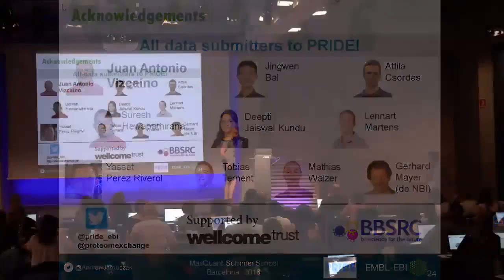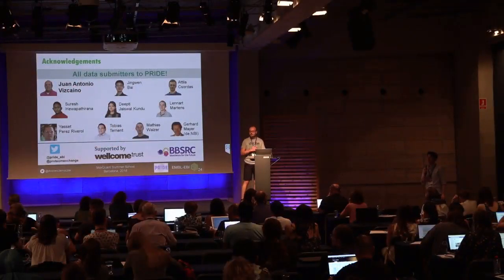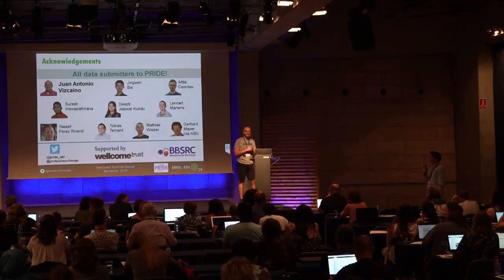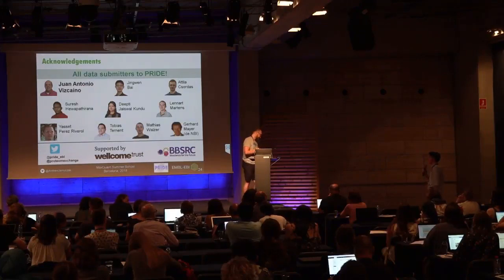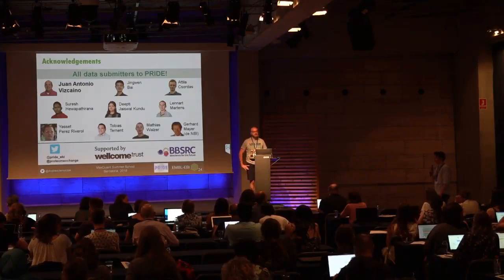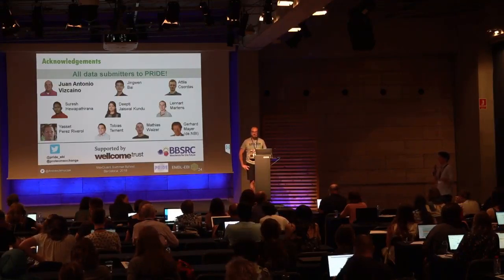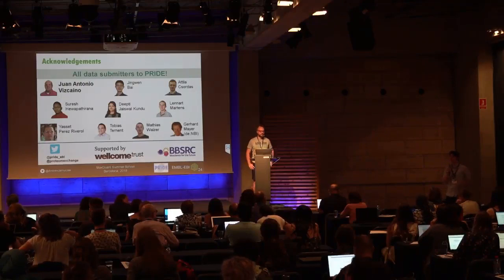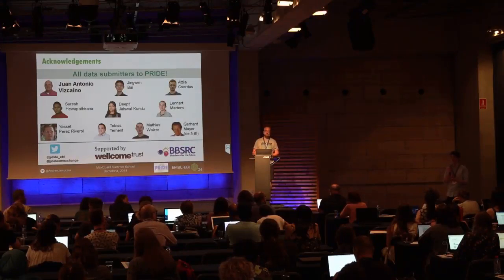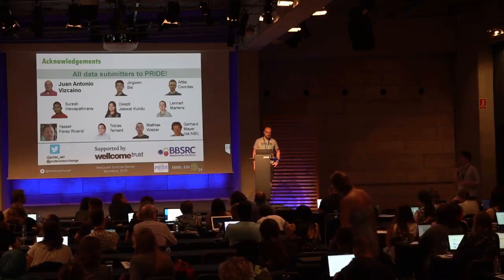Thank you very much. Does anyone have any questions about PRIDE uploads? PRIDE itself? For me, it's one of the most important aspects of proteomics data moving forward. I frequently download other people's work and check it. For example, Josh Coon yesterday mentioned he has these new columns, and he's going to upload those raw files to PRIDE, and I'm going to download them and compare his chromatography peak width to what I get in-house. And I'm going to do that in MaxQuant. This is the thing that you get when you have a repository like PRIDE.